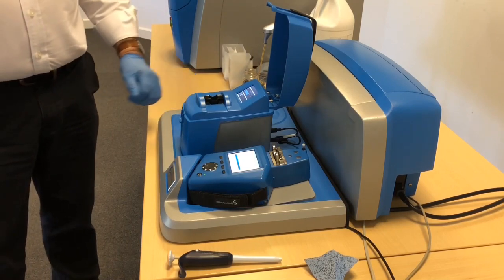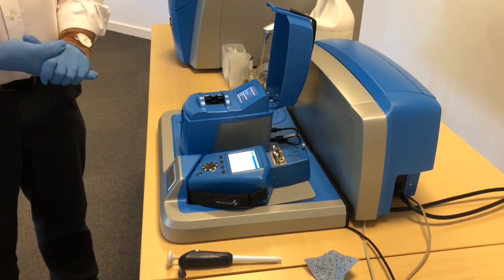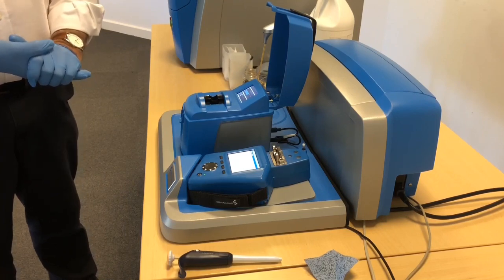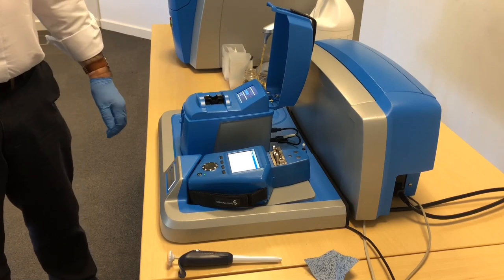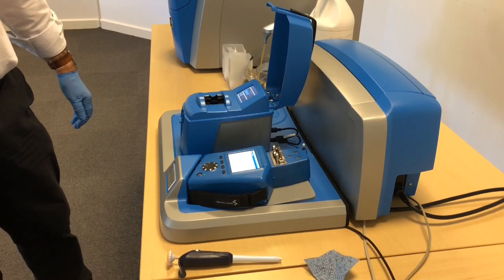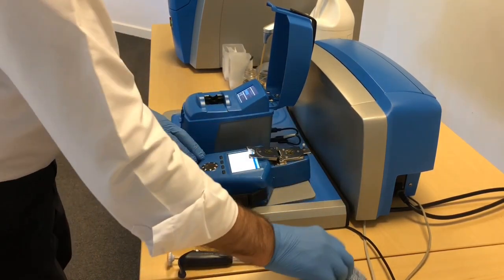It will give us our total counts in various particle sizes, and also image the particles into the classical wear shapes, whatever it finds. Not only that, it finally does a large ferrous and total ferrous analysis. This is the part that takes, I would say, the longest, 2 or 3 minutes perhaps of the whole thing. Other than that, I can see on the device console screen that the oil chemistry side has finished and reported its numbers, so I can be cleaning that out, ready for the next sample.